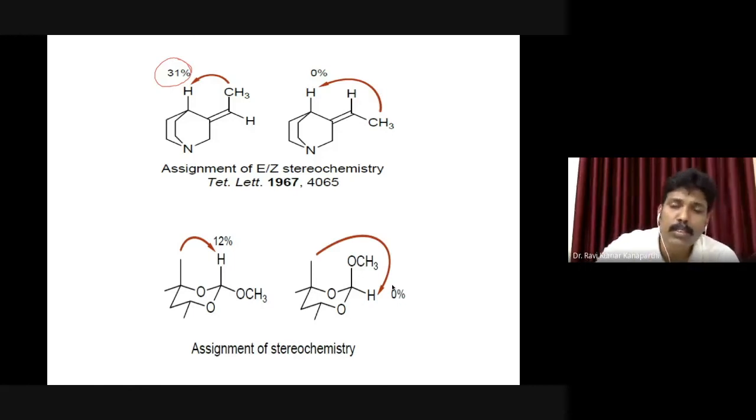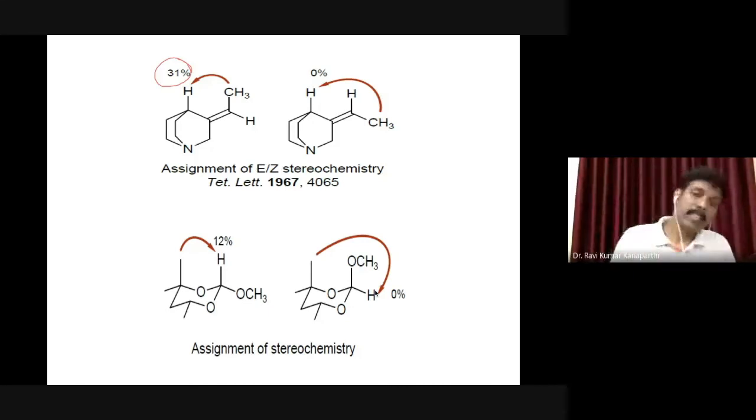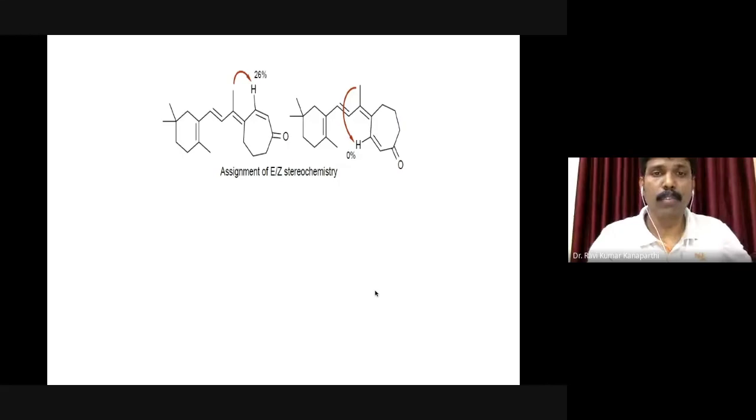So when you try to calculate the NOE enhancement from this methyl proton and this one, you don't see it, because both are very far. If both the partners are very far, more than 5 angstrom, then you don't see the NOE. Therefore, it doesn't give any signal enhancement or decrease. Therefore, we can conclude accordingly whether it is an axial proton or equatorial proton.